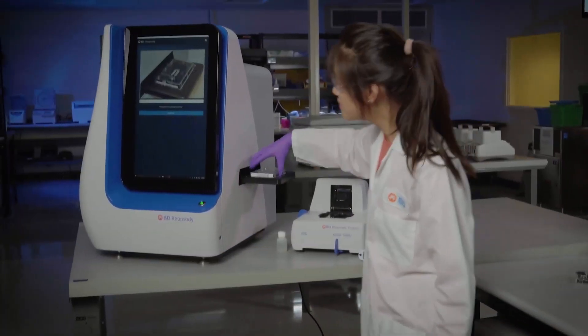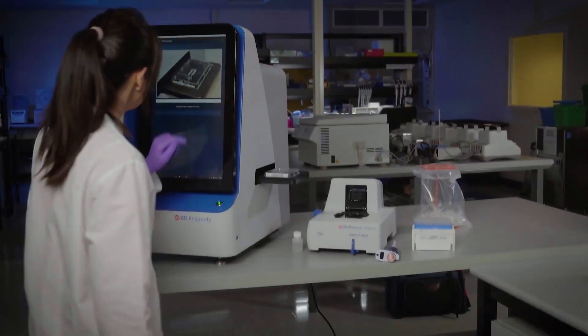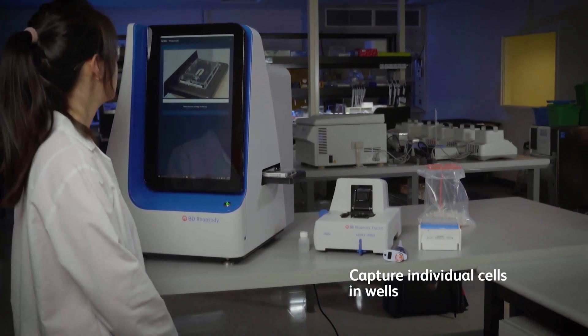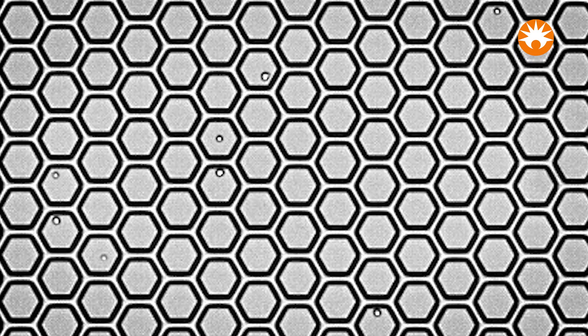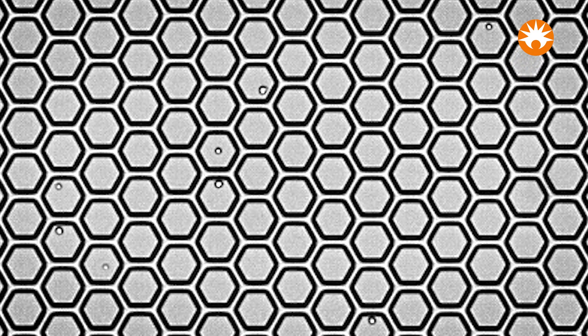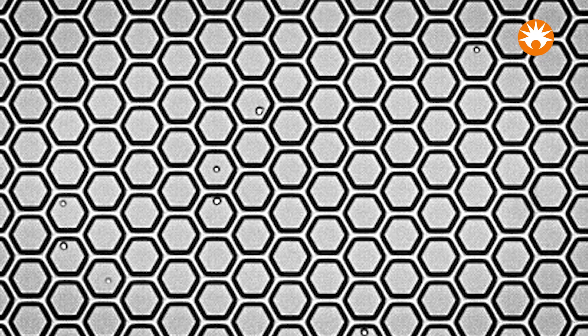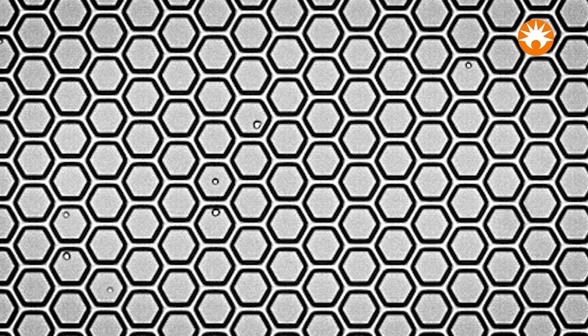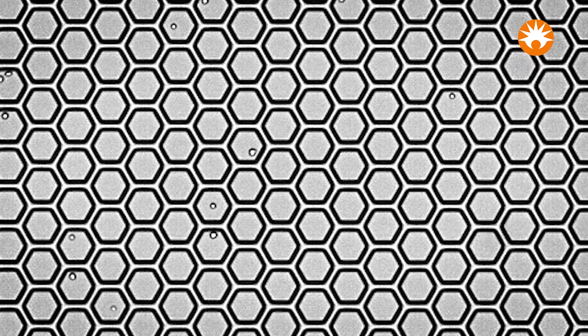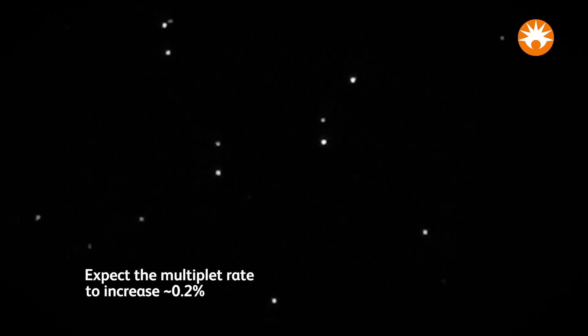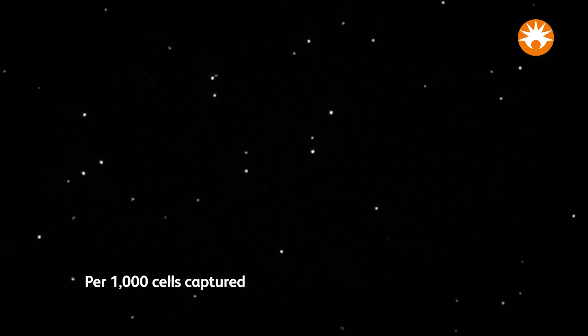The first step of the BD-Rhapsody scanner workflow is to capture individual cells in wells. The scanner will count each of the cells and report back the number of viable cells captured in a well and the actual multiplet rate. If these numbers are in line with your expectations, then you are clear to proceed to the next step of the protocol. With a perfect single-cell suspension, we expect the multiplet rate to increase about 0.2% per 1000 cells captured.